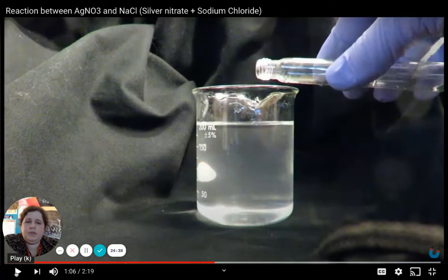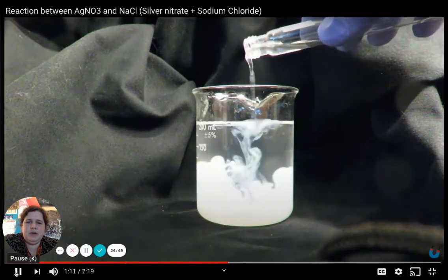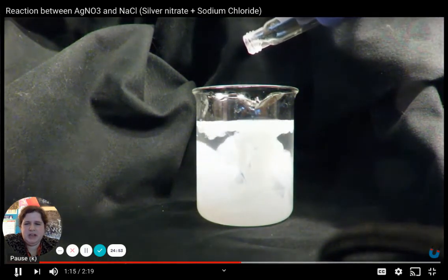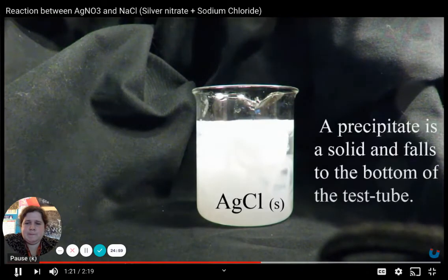It's also important that they're split up into their ions before so that they can regroup with each other in the solution. Okay, so he mixed them together, and notice it's forming this cloudy, murky, milky look. They change places, a double displacement reaction, and we get AgCl, which is a solid.